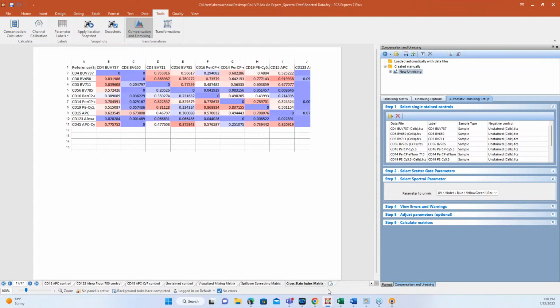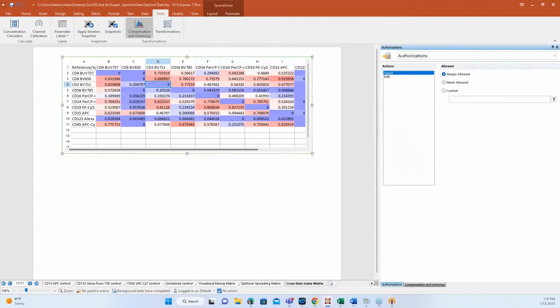Yep. So one thing real quick, Robin, before you move on, I wanted to mention that I've personally gotten some questions from people about this conditional formatting that we see here. So these purple and red colors, and people were worried that, oh, if this is red it is bad, and if it's purple it's good, and what does that mean? And I think it's more to draw your attention to these numbers.